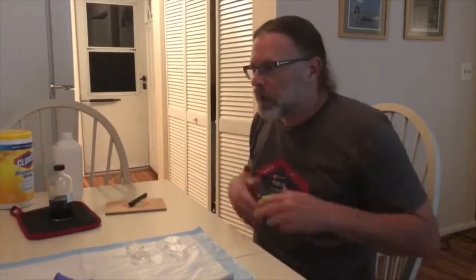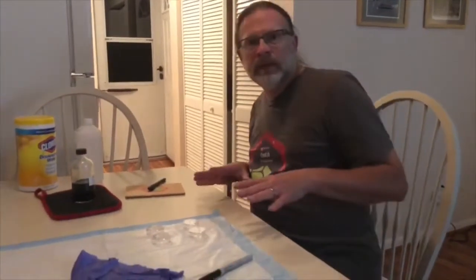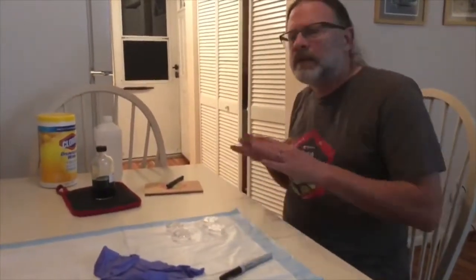Okay, we're going to go through the setup for ExoLab 6. If you remember, we're growing bacteria in this microbiology experiment, so it's a little fussier than our previous experiments with plants, but it's still very doable in the classroom. So I've created what we call a clean field. It doesn't have to be totally sterile, it just has to be super clean.